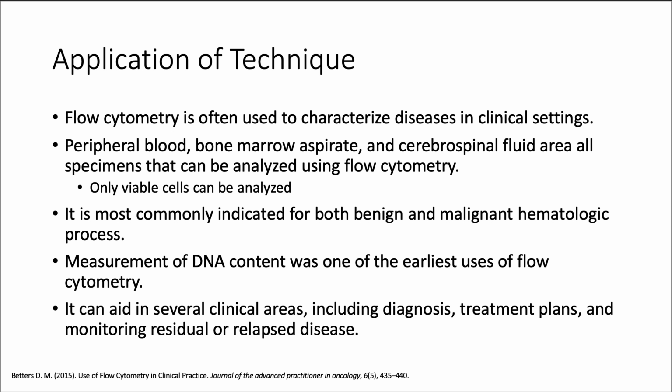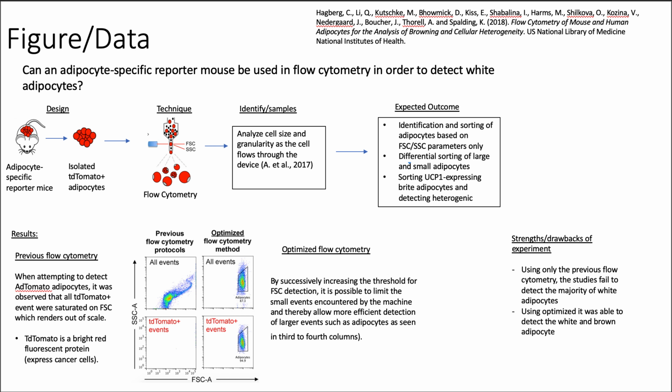The measurement of DNA content was one of the earliest uses of flow cytometry. It can aid in several clinical areas, including diagnosis, treatment plans, and monitoring residual or relapse disease.